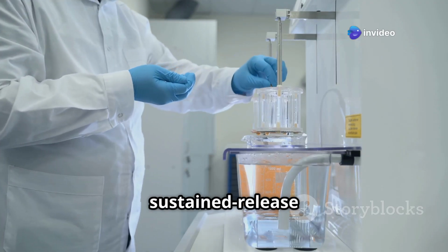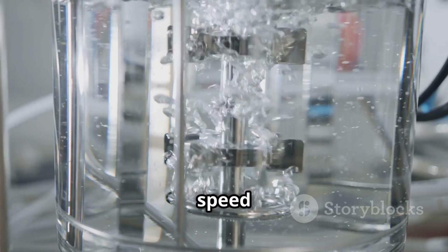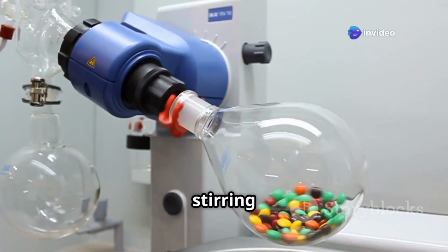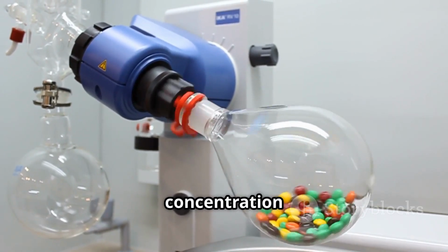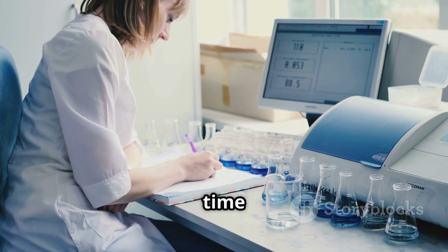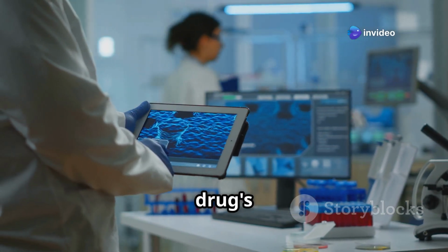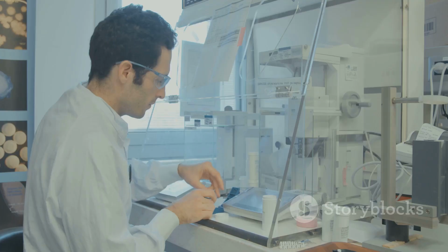In contrast, a sustained-release formulation might only need sampling once or twice a day. The speed of the experiment, specifically the stirring speed in the receptor compartment, also plays a vital role. Adequate stirring ensures uniform drug distribution in the receptor media, preventing concentration gradients that could affect the result's accuracy. Determining the appropriate time points and speed ensures that we capture the complete drug release profile. This information is crucial for understanding the drug's behavior and optimizing its formulation for maximum therapeutic benefit.